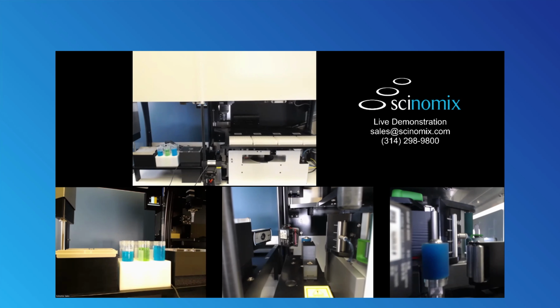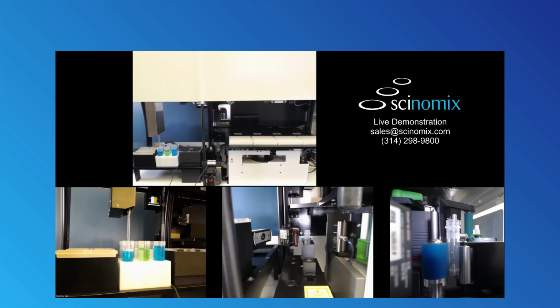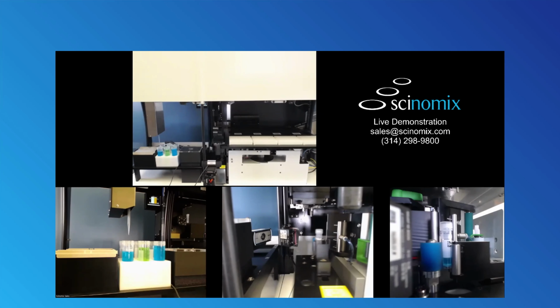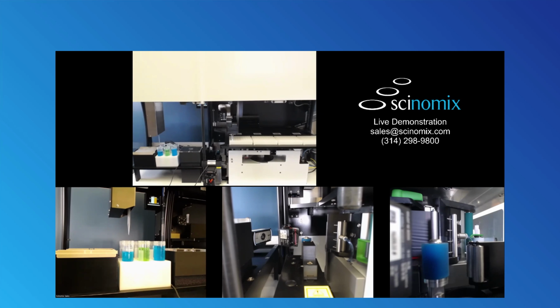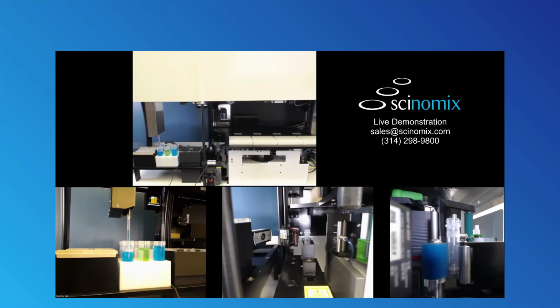All right, so right now you can see that our VXL has gripped a tube. The Scinomix AQ is now doing a liquid level detection to find the liquid level of the tube. Once it finds the liquid level, it will aspirate. It does a tip touch here to ensure that all liquid's been removed from the outside of the pipette tip. And then you can see it dispensing here into that uncapped tube. The AQ returns over to its source liquid in case there's any droplets. That way we're making sure it winds back up into the correct source bottle. The Scinomix VXL has now labeled the tube, recapped it, and returned it back to the rack. And then the process rinses and repeats.